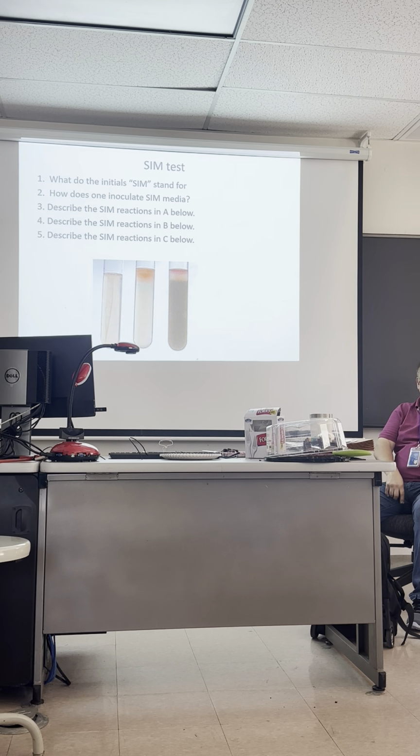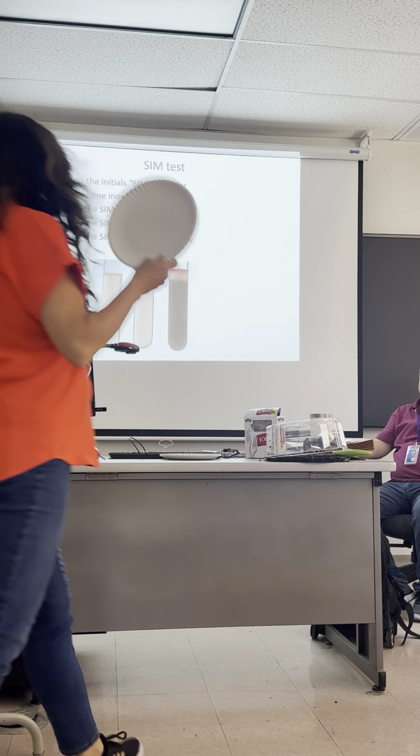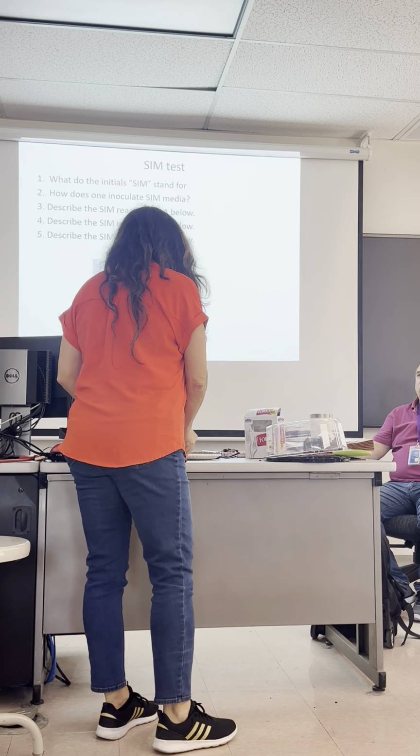Okay, so this would happen here, Sarah. I know you can see it. It looks like it goes out that way, right? But what happened here is somebody went in and then they moved, but it's not fuzzy at all. Okay? Good? Okay, here I've got red here and fuzzy there, so S, negative, there's no black, it's negative. I, positive, it's red. And M, it's fuzzy, it's fuzzy. Perfect.